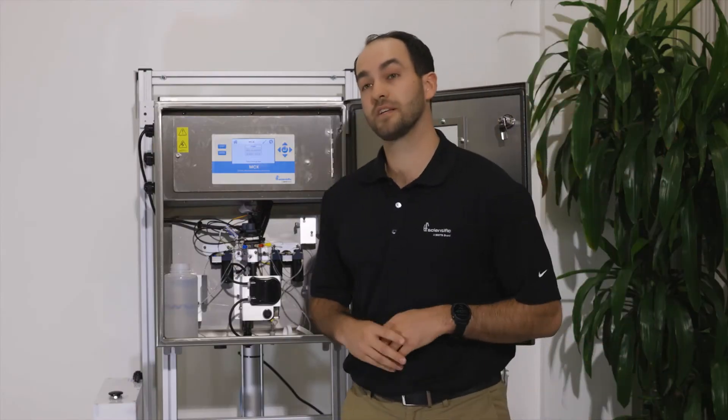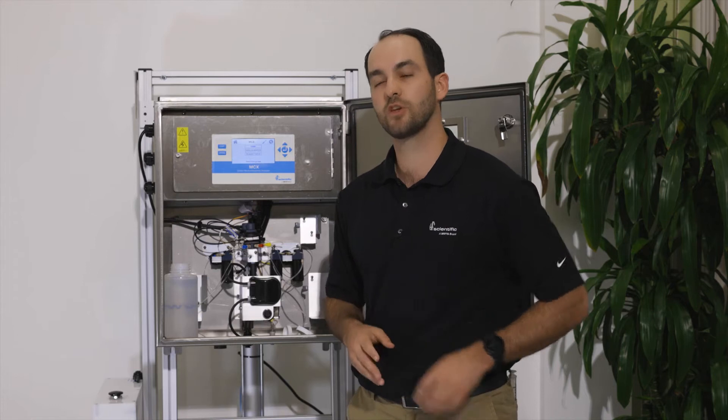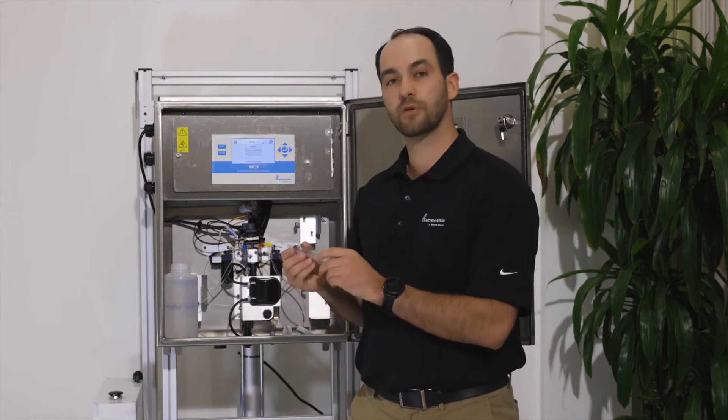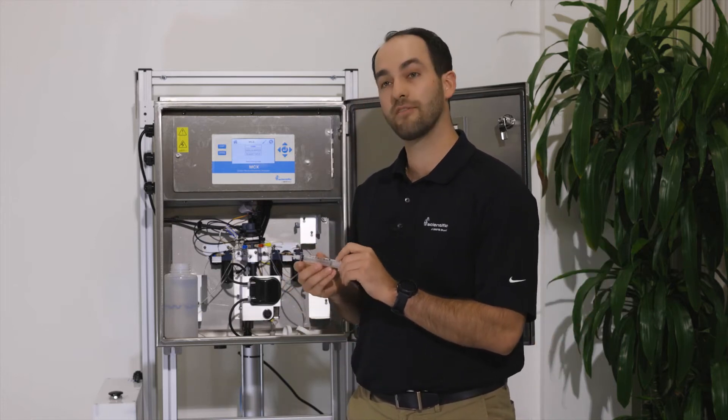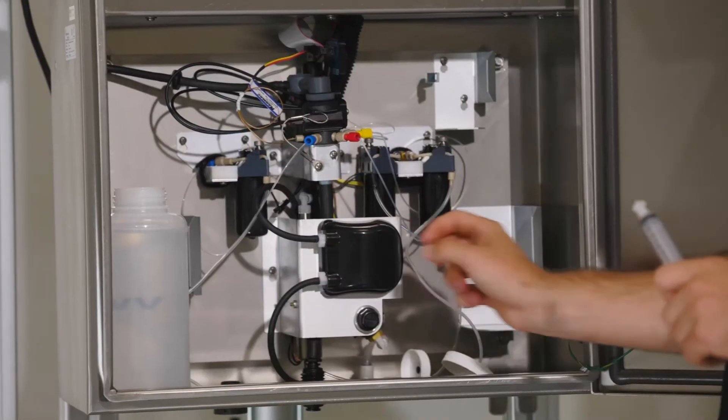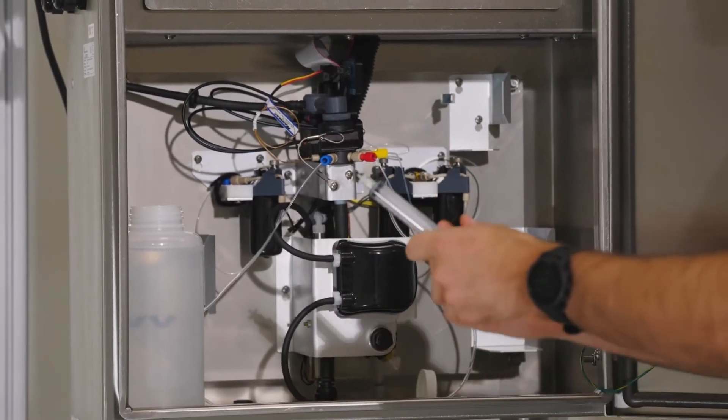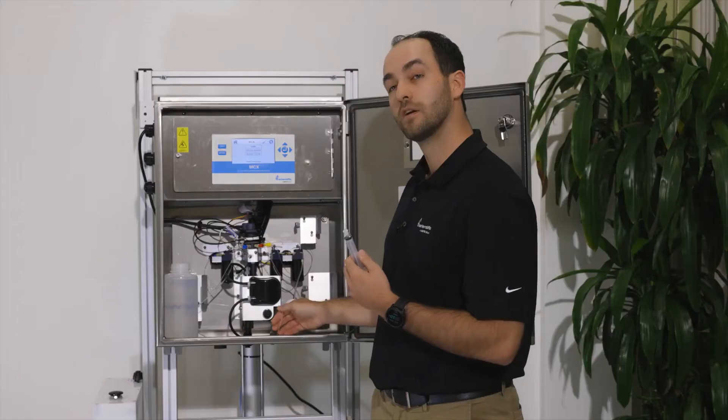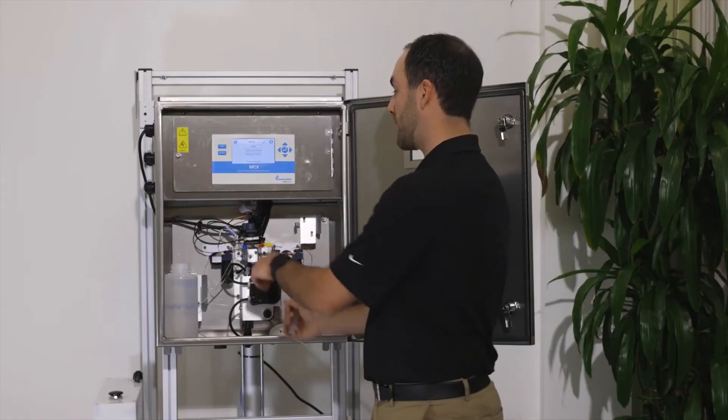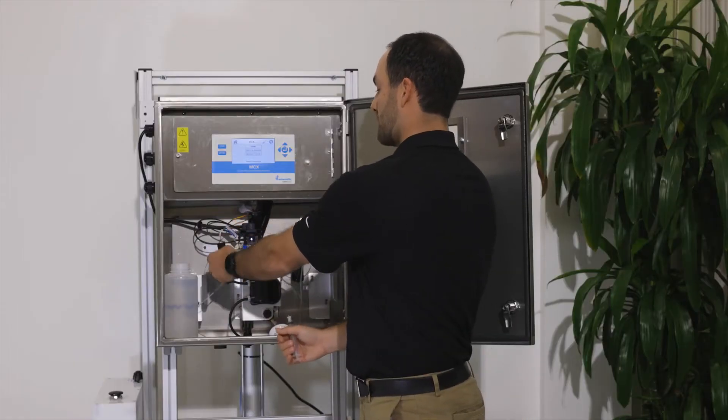The next part is very important. This is flushing the lines. You will take the syringe that was provided with your analyzer and fill the syringe with DI water. You will push the DI water through the bottom of the tube and into the optical block. For this procedure, you want to remove the light shield so you can see inside of the optical block.